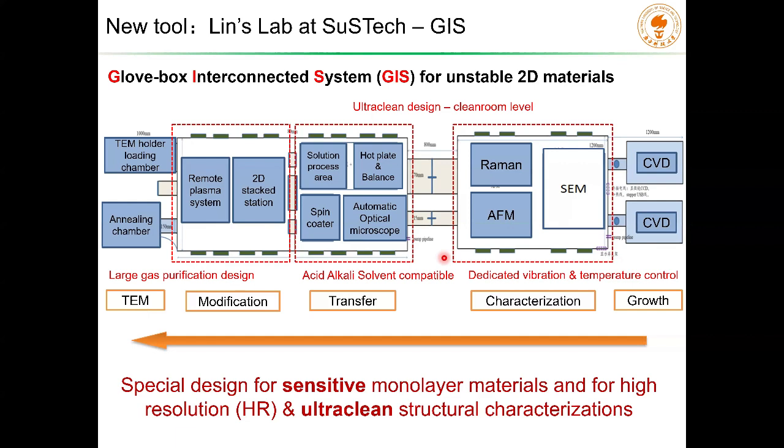It is a special design for sensitive monolayer material and for high resolution, ultra clean structural characterization. We are very afraid of contamination, and we want to avoid any contamination at each experimental stage, so we need the whole experiment integrated inside the inert gas environment.